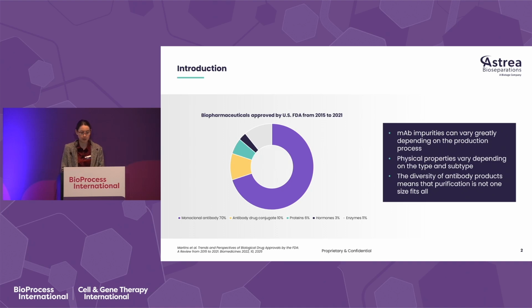But monoclonal antibodies are a diverse class of products, particularly now with the advent of humanization of mAbs, the mAb fragments and bispecifics. The products are getting more and more complex, and that means that the purification of these products is getting more complex as well.